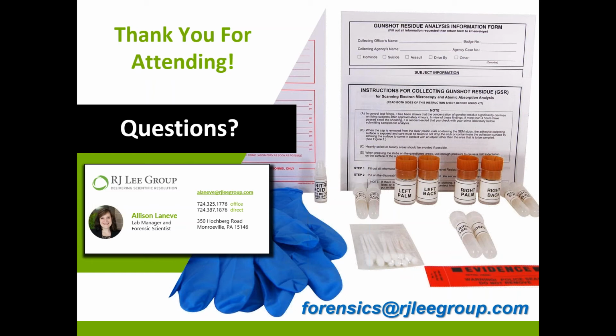Now, however, if you are looking at a garment and you're going to collect DNA from a garment like a sweater, there are particular areas that are going to be more probative on the garment for DNA than for primer gunshot residue.